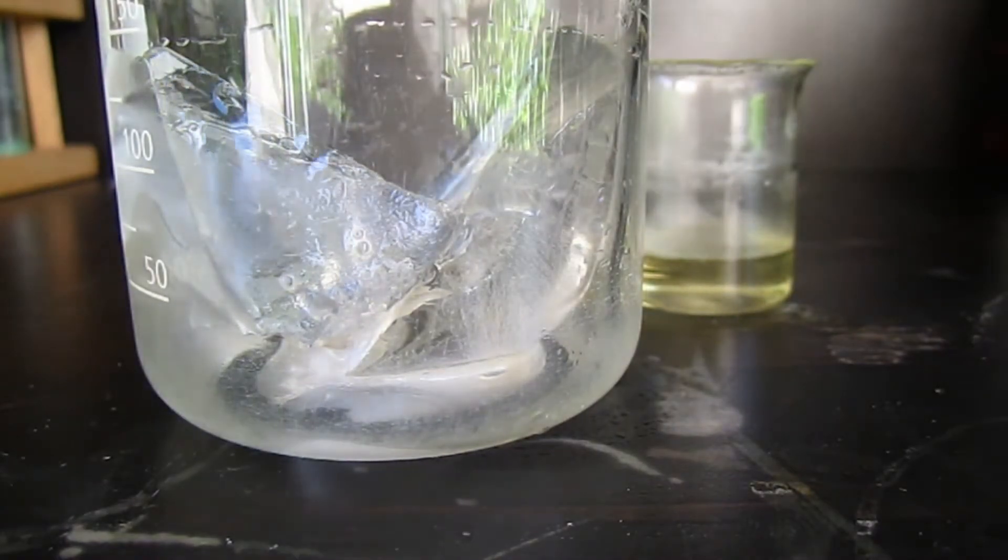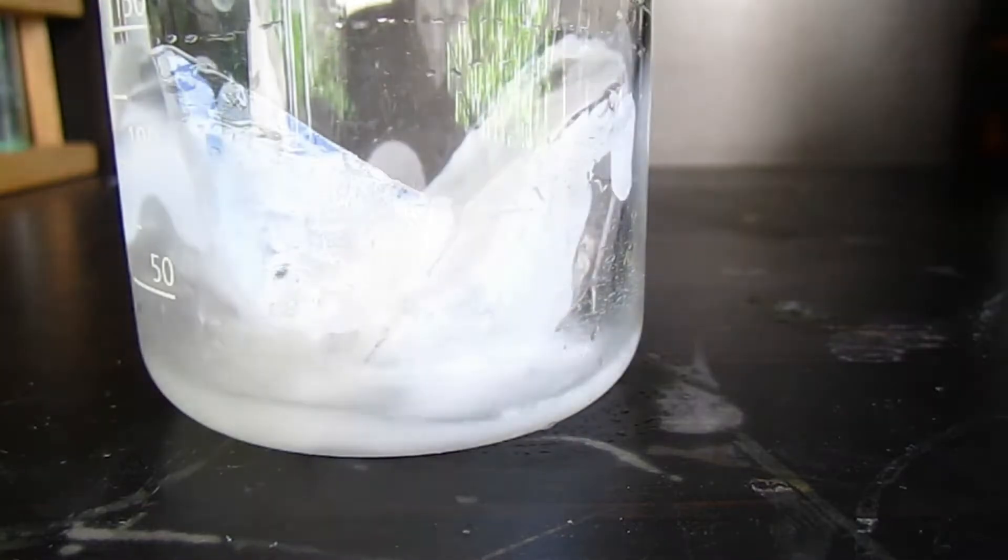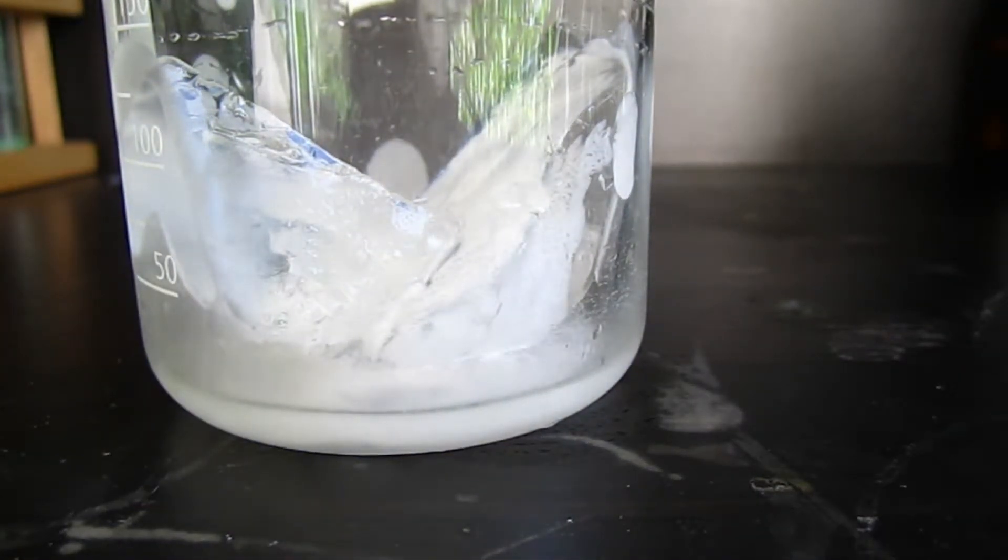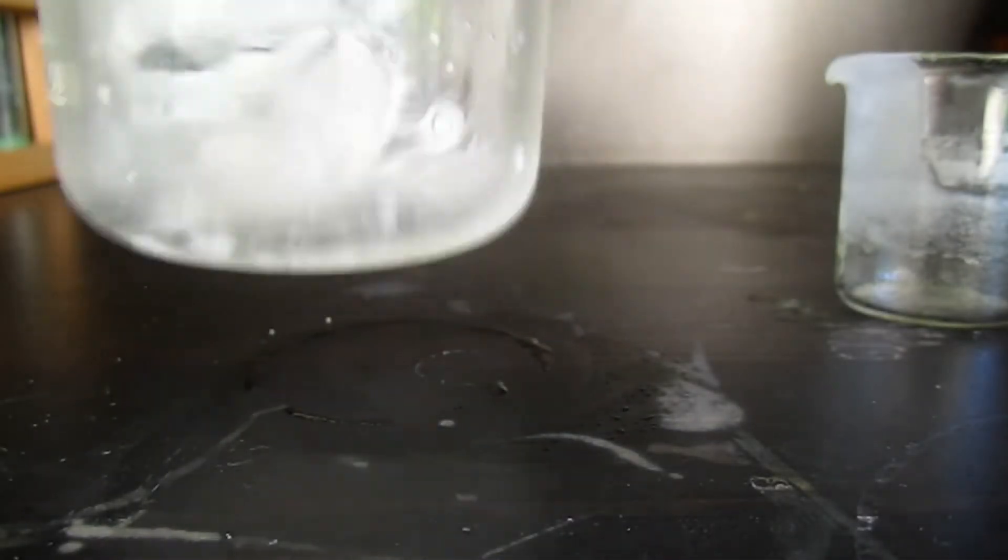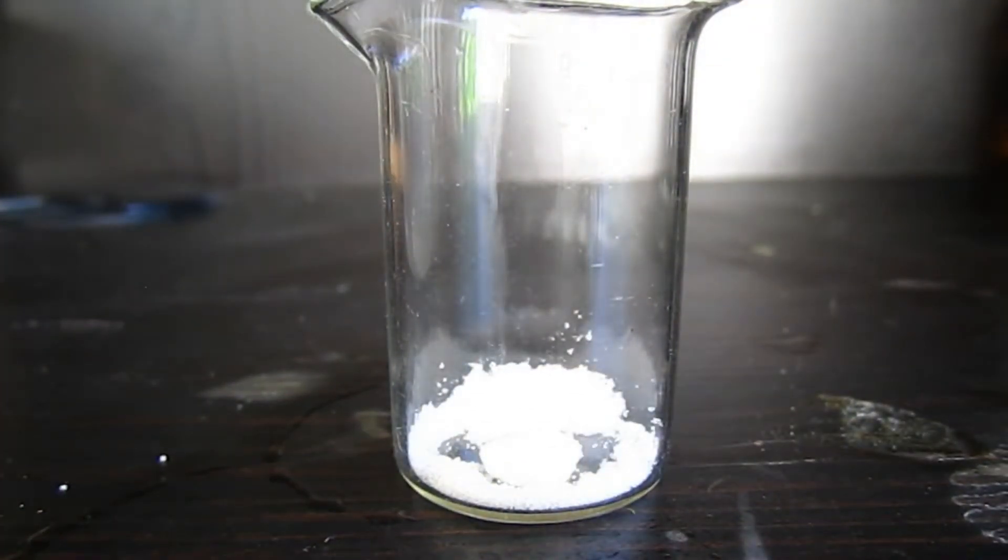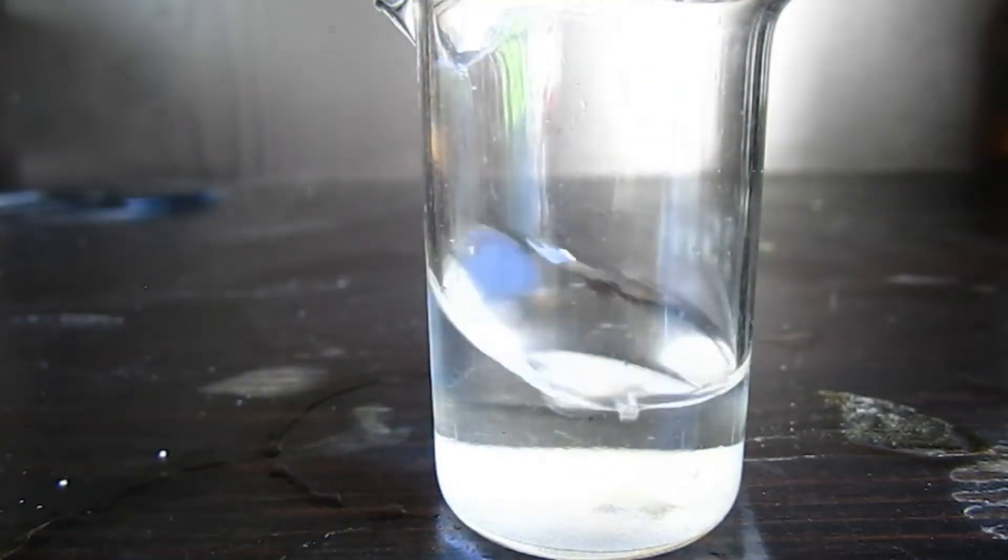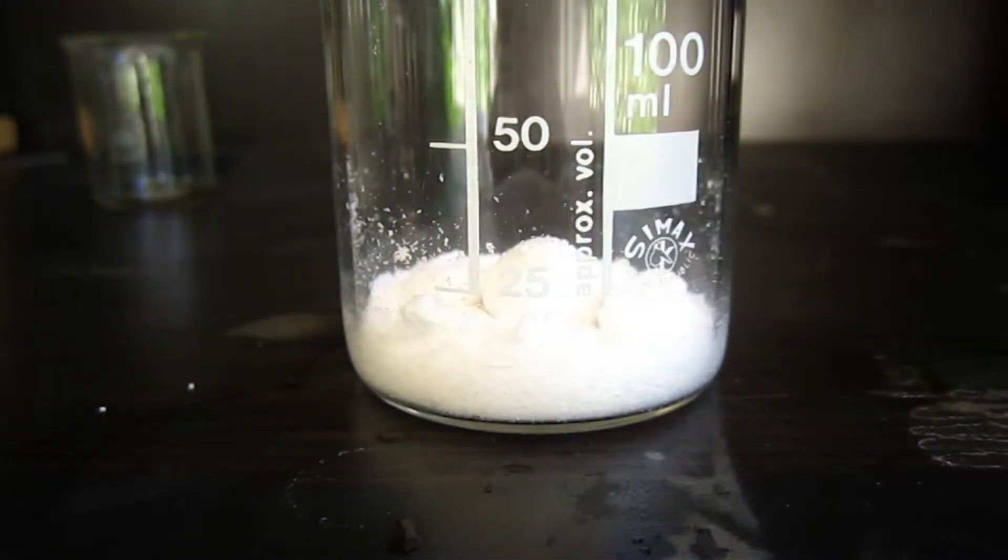Alright, so I got some ice here and I'm just going to add the aniline hydrochloride to the ice. You can see it precipitated out, but that's not a problem. So now I'm going to prepare a solution of sodium nitrite, also going to dissolve up the sodium acetate.